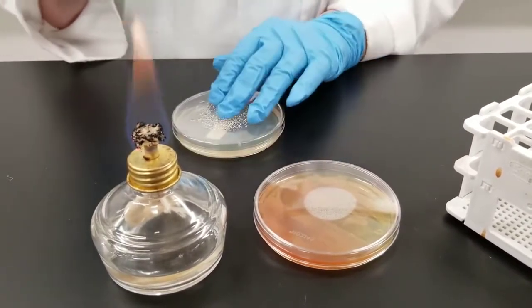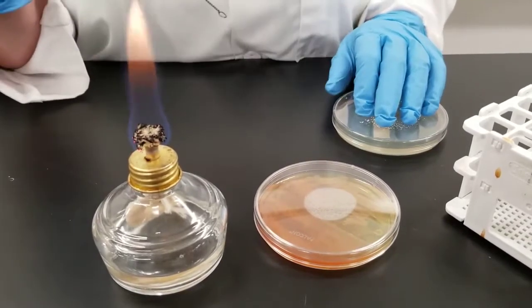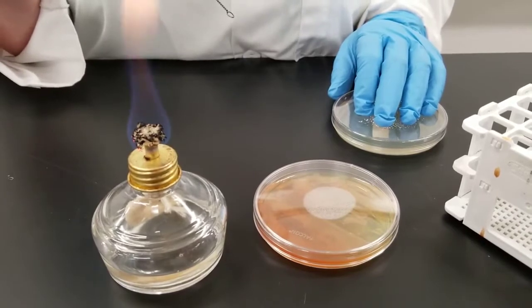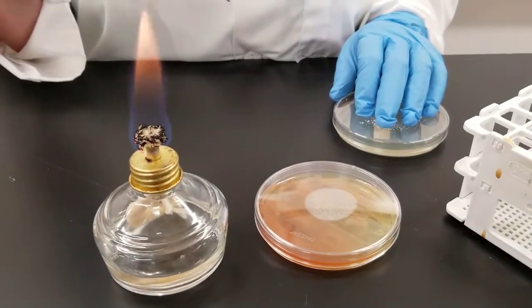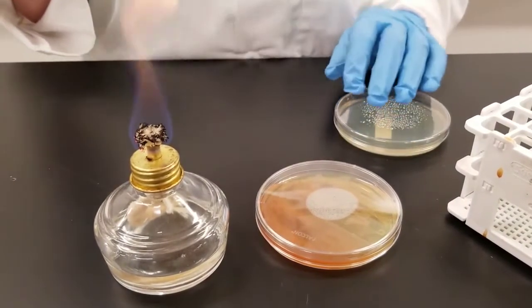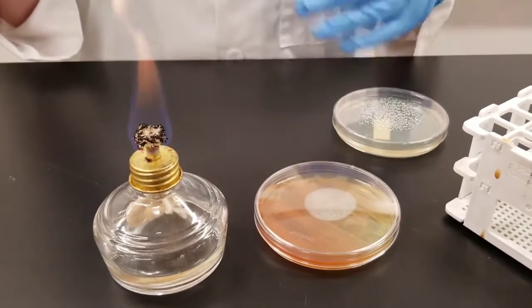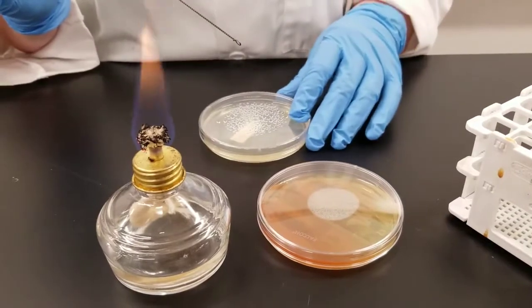The first plate you noticed was pink — it's called a MacConkey agar. It is selective and differential. It is selective in that only gram-negative bacteria will grow on it. And it is differential in that, depending on how it grows, you can tell a difference in color as to whether the organism is a lactose fermenter or not. We will look at these after they have grown and explain the results at that time.